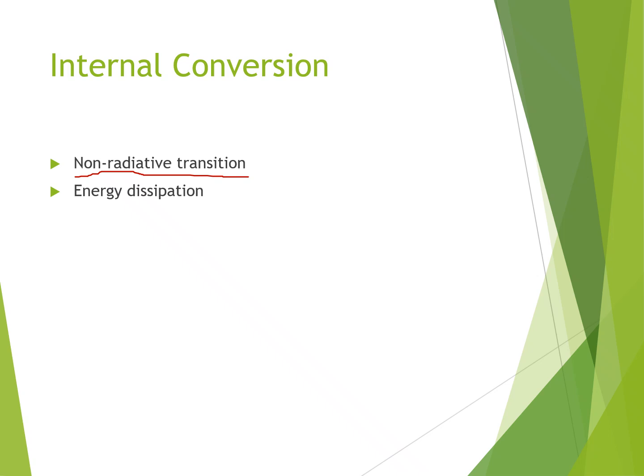This is the internal conversion process, and it is a non-radiative process; no light is emitted, and it takes place before the emission occurs.